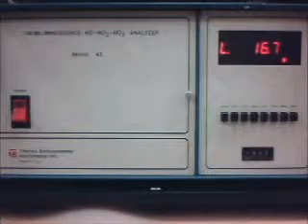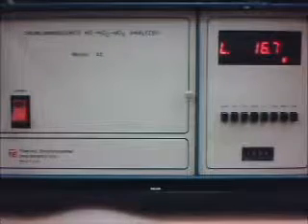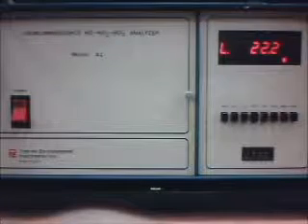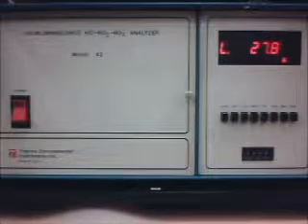Basically, how I understand the NO2 analyzer works is that you send a sample of NO, nitric oxide, through. The nitric oxide reacts with ozone, and this reaction produces NO2 and O2 as well as light.